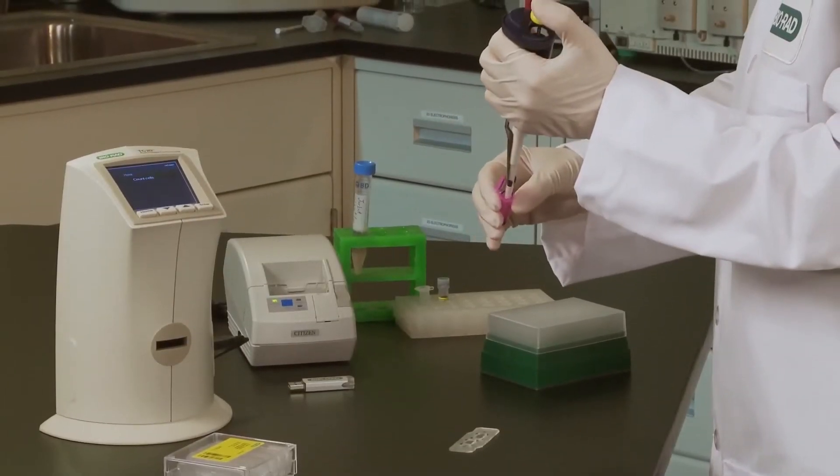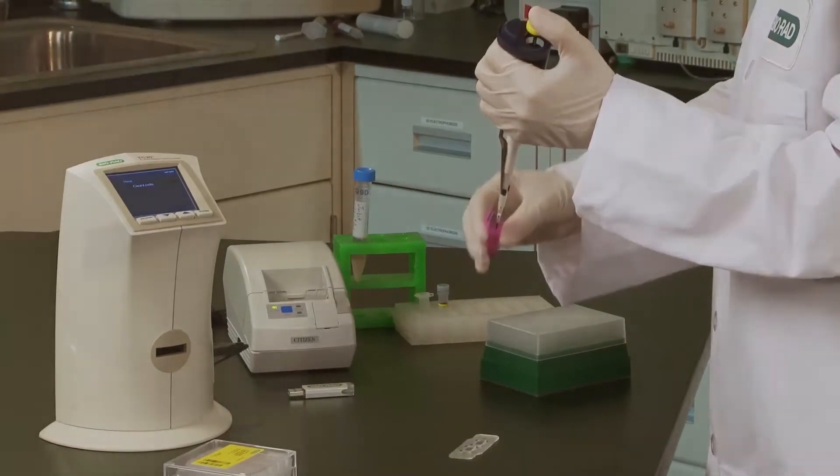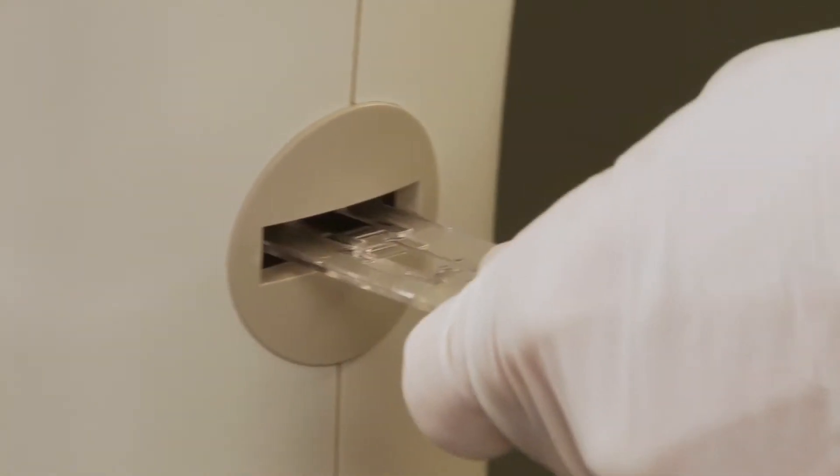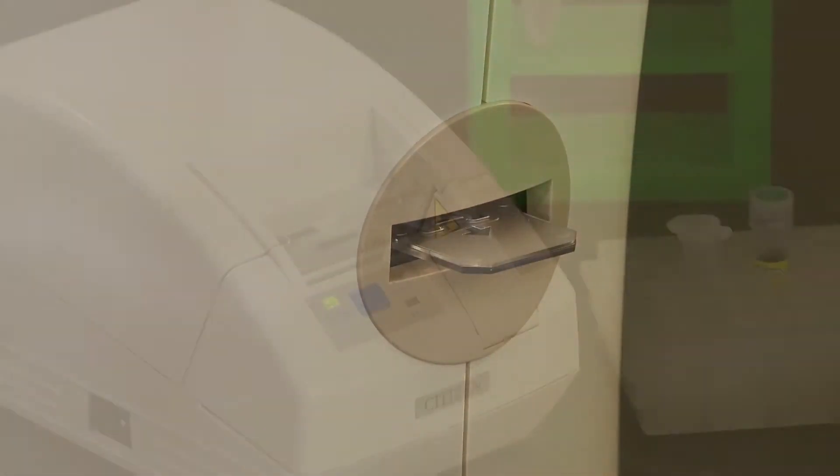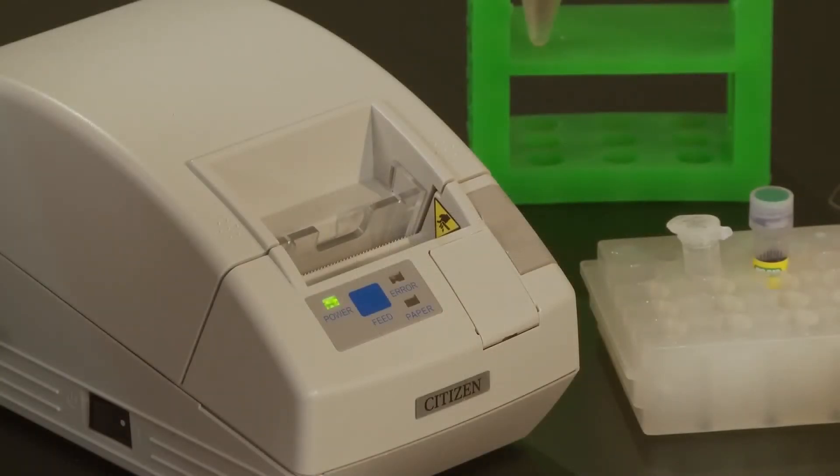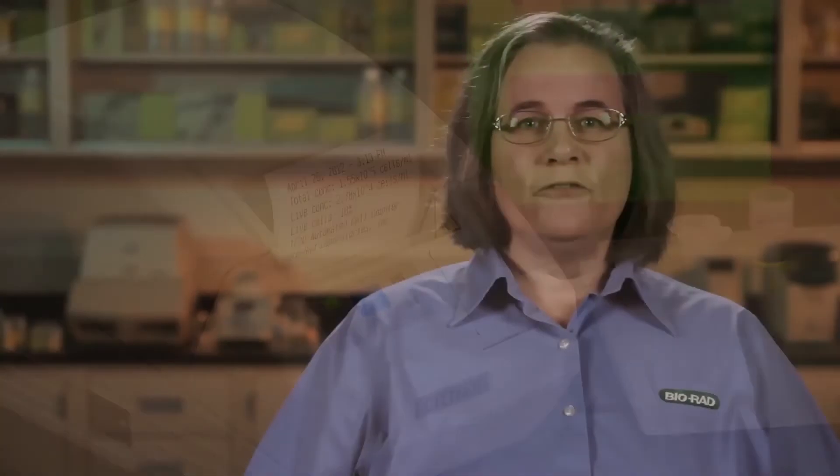There are going to be times when even the most basic and reliable equipment needs maintenance to keep it running smoothly, and that includes peripheral gear like the printer for your TC10 or TC20 cell counter. If you're experiencing misalignment of printed labels, this simple fix should have you printing again in no time.